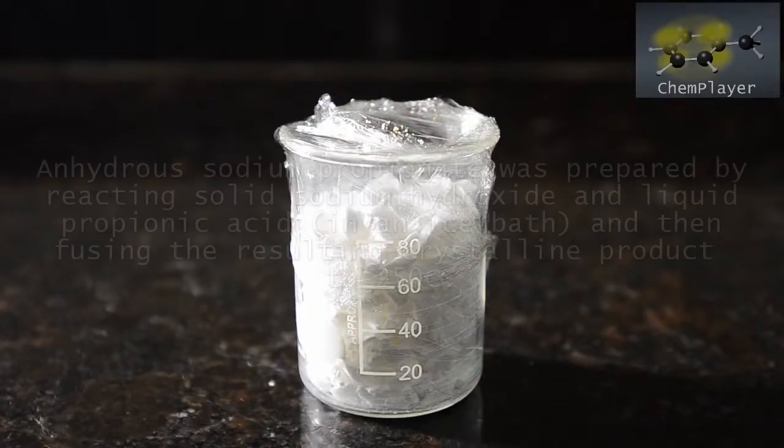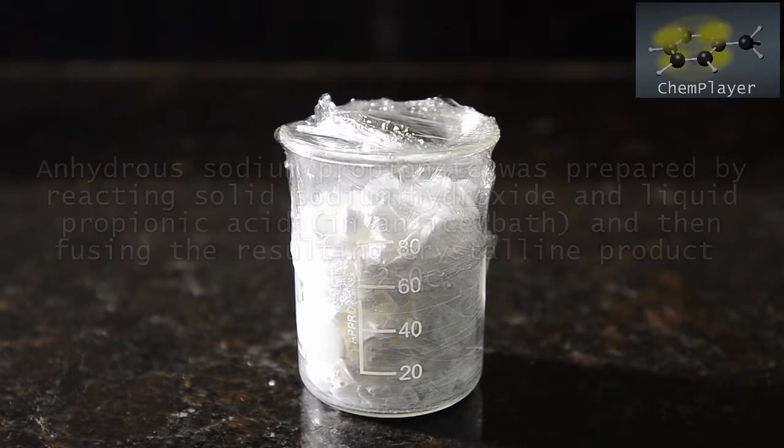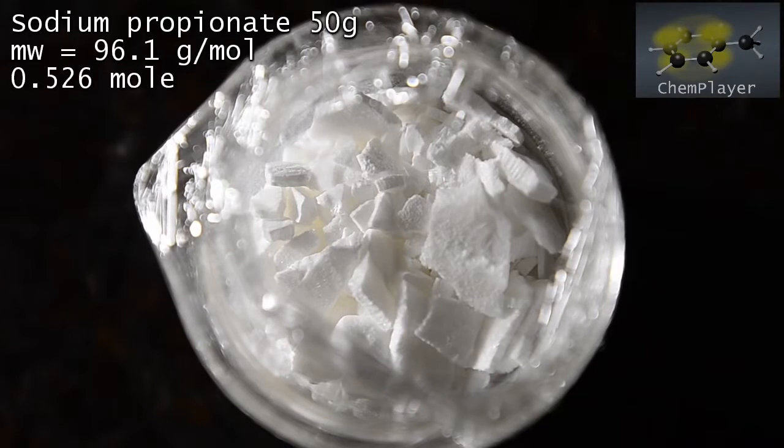For both preparations today we prepared a batch of anhydrous sodium propionate, and we melted this to ensure it's completely water-free. For the first experiment we're going to use 50 grams, which we weighed out ready and then covered with film to stop it absorbing any atmospheric moisture. As you can see, it's in little chunks where it has solidified after melting.